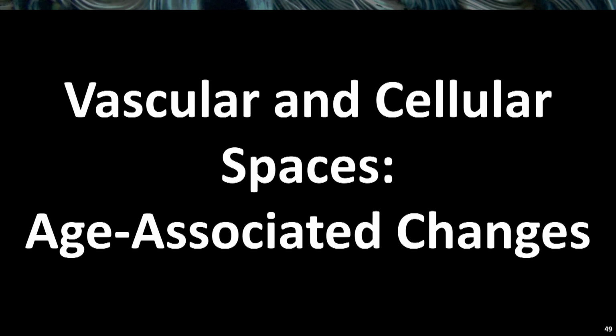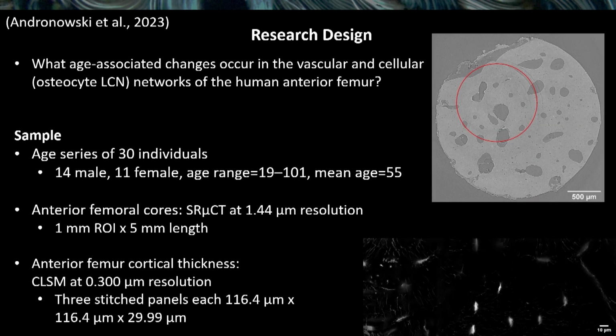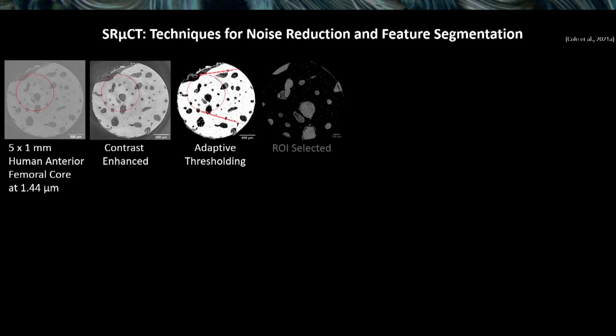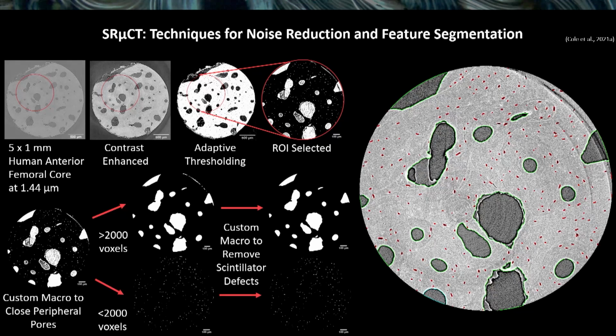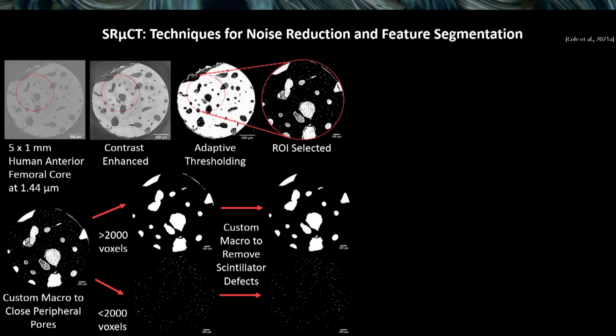All right, I think I might be out of time. Okay. Let me just show you this real quick. This is some visualization I did with synchrotron radiation micro-CT using a very similar macro set in addition to some aspects to correct for the, sorry, one second.